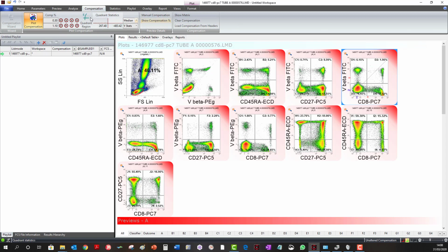So, you can either drag this population back up or use the controls in the ribbon. The single arrow up will move the population up slowly, or the double arrow up will move the population more quickly. So as this is quite overcompensated, we will use the double arrow until the values are approximately the same.